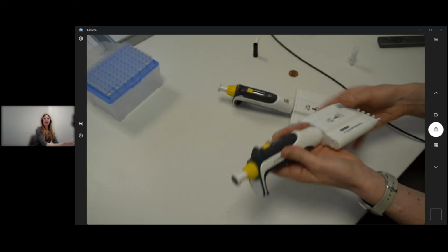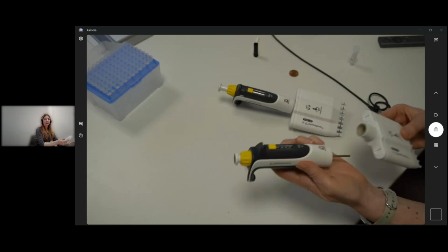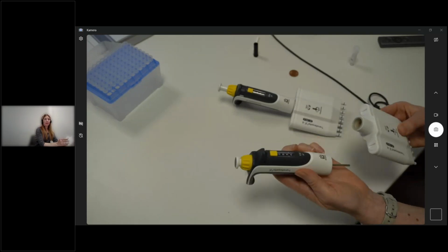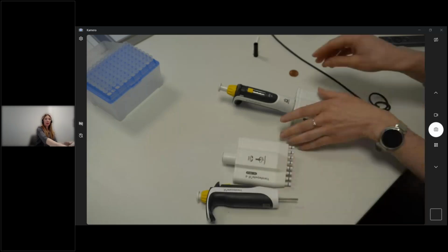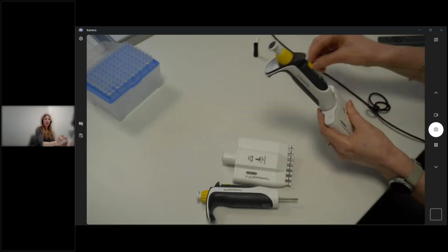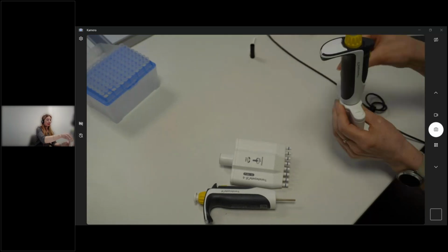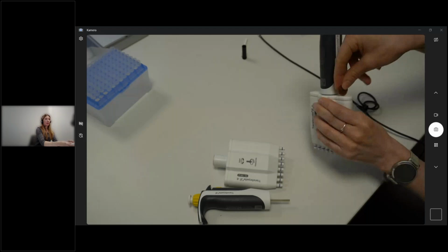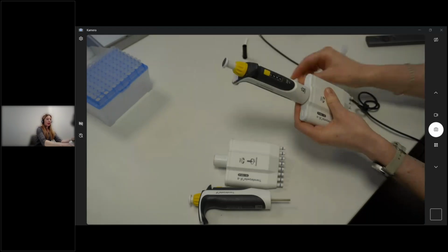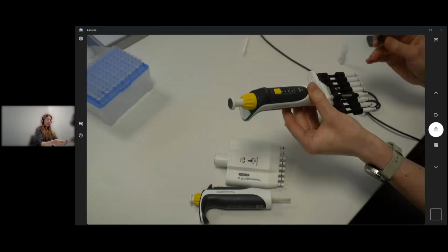If the pipetting unit is unscrewed, it must be pulled down again in order to disconnect the magnetic coupling. Take a coin, for example, and rotate both closures of the pipette housing cover by 90 degrees and pull off the pipette housing. Then you can remove the shaft using the installation tool.